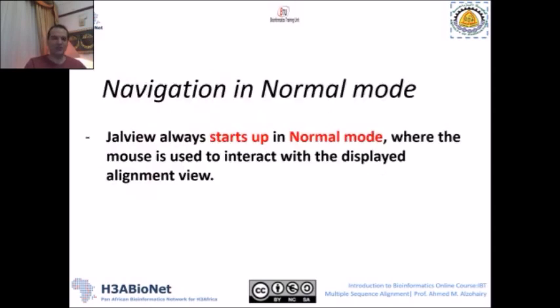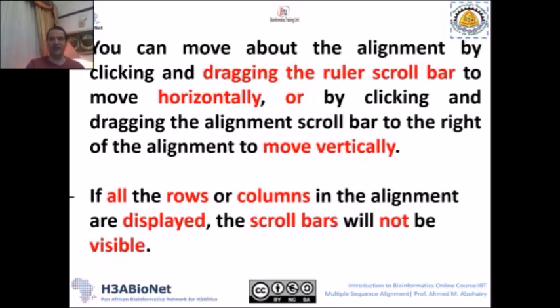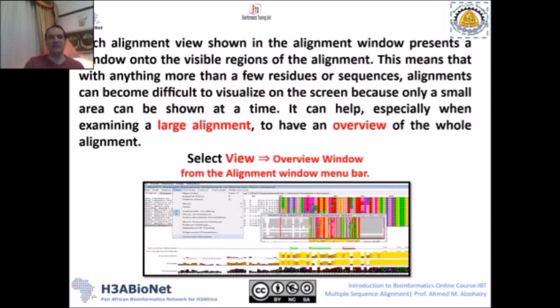Of course, when you start up Jalview, you always start with the normal mode, which means that you can use the mouse to move right and left. And of course, you can drag and move using the mouse in Jalview. If you have a large alignment, you would like to see this large alignment in a small window.